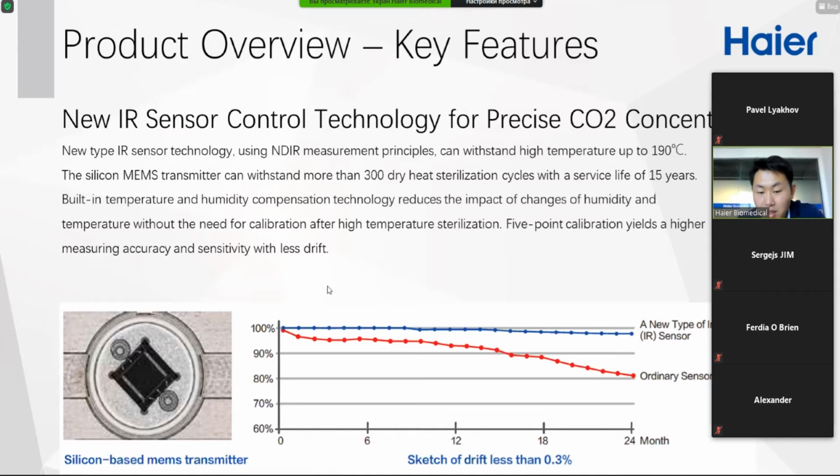Actually, inside this one, they have two main sensors inside, and they also have 3 other small sensors inside. And later I will send you the Excel list for the spare parts, the spare parts list for this equipment, and you can check.